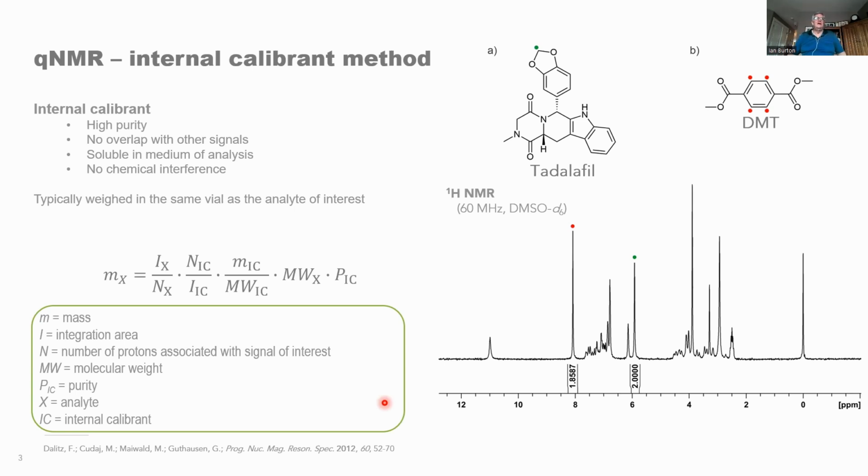That's what makes it what I consider the best technique, in that you don't have to create a calibration curve or have the same compound to create a calibration curve. You can use an external standard or an internal standard of any chemical type, and as long as you adhere to quantitative conditions, the two are comparable.